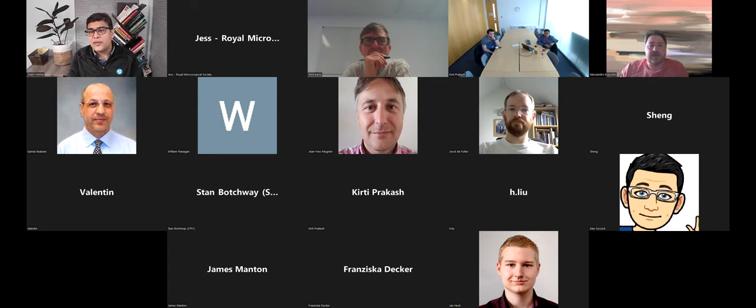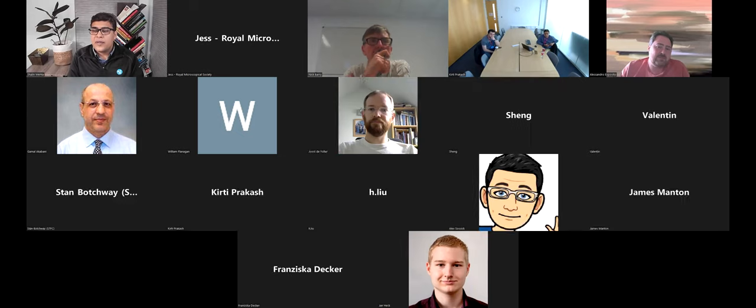Yeah, okay. I guess because you have four images, each of them is like an RGB camera, so each of them is losing light on top of the quantum efficiency. I guess this is the problem. That's an issue. When we work with cells, we always work with sCMOS cameras. In fact, we do use some of the FLIR cameras, the IMX250 chip that is used by many of the FLIR cameras. It's almost as good as scientific CMOS. These cameras don't have cooling, so the noise is slightly higher, but when we work with transmitted light, there's a lot of light, so it's very easy to get into the shot noise limited regime. Yes. Okay, thank you very much.